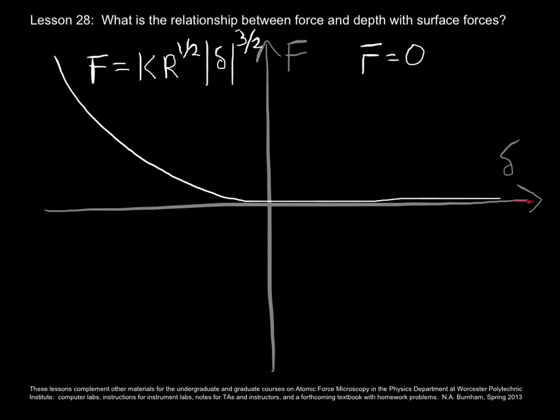That the cantilever is stiff enough, there are no instabilities at the cantilever, and the sample is acting on the tip, so the cantilever bends forward, and whatever attractive forces there are acting on the tip from the sample, by Newton's third law, the tip acts on the sample, and so if the sample is compliant and the work of adhesion is strong enough, then the sample bulges out from the nominal surface position, which would be the y-axis here, to greet the tip, if you will.